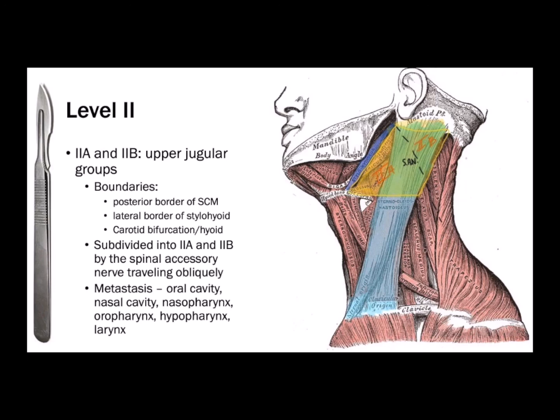So when I'm looking at it on a body or a diagram, I like to use the hyoid bone, because a lot of diagrams won't show the carotid. But again, you're not typically going to have that unless it's attached to like a larynx specimen. And so oftentimes when we're orienting these neck dissections, the split between levels 2, 3, and 4 can actually be kind of arbitrary, which is why it's so important to have a good line of communication with your surgeons.